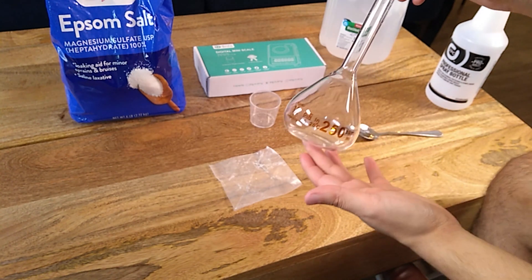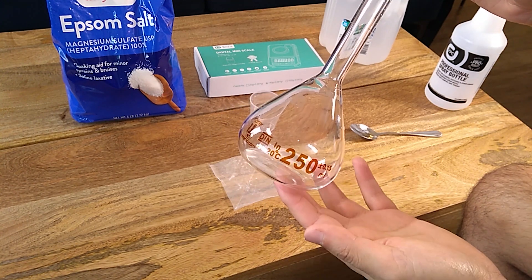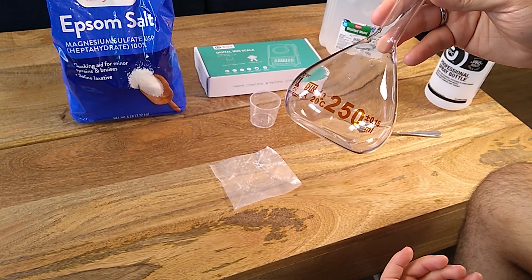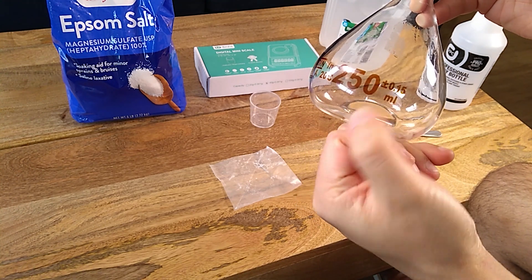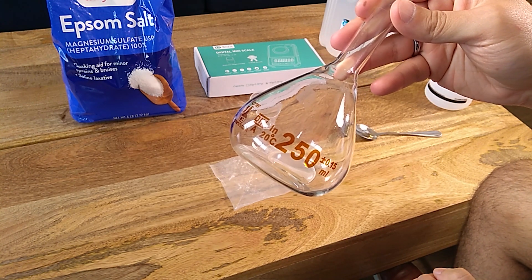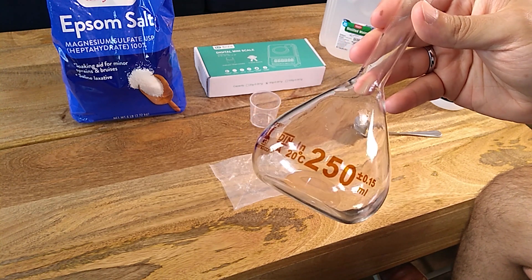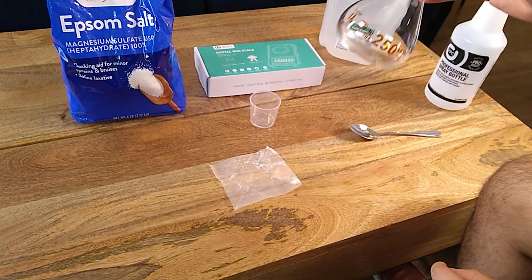There is also this, which is very important — a volumetric flask — which is what we will use to actually prepare the solution. We will be preparing a volume of 250 milliliters, which will be enough to prepare 25 liters of final foliar solution. It's important to use volumetric flasks because the precision of a volumetric flask is really good, while the precision of things like graduated cylinders is very low. You want to use something that's very precise, like volumetric flasks.